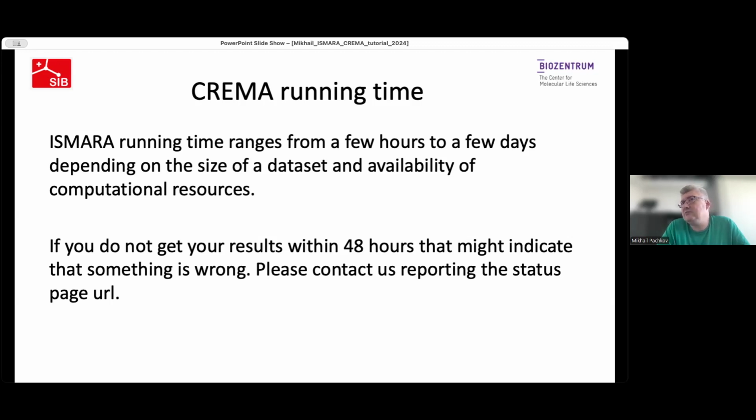On average, I would say that small data sets require at least a few hours, but for large data sets, it will be a few days to run the analysis.